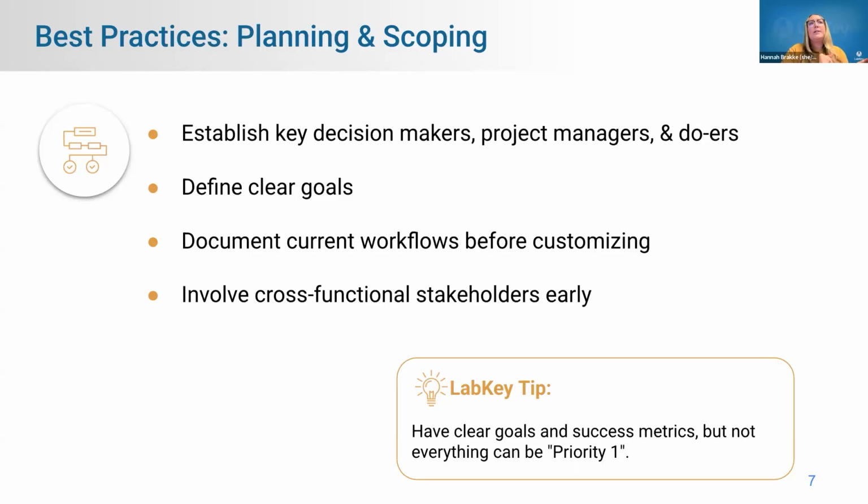The third one here is around documenting those current workflows. It can be arduous, I would say, to go through and document everything that you want to capture within your LIMS, but it can be very helpful to identify early on where the biggest pain points are.